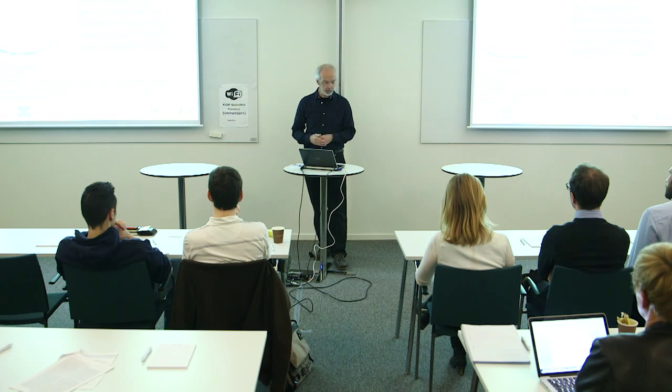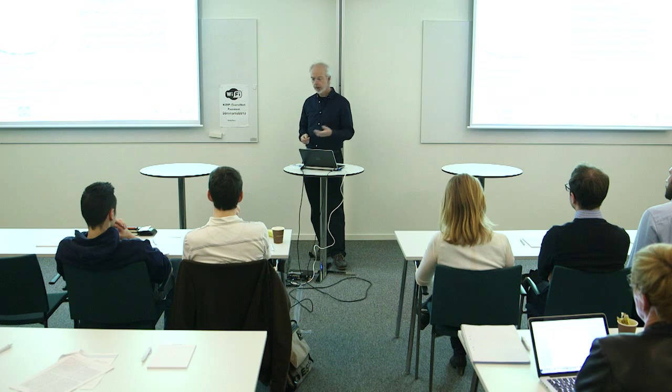That was done before we went into this technology, and it gives a perspective of what you can achieve, because with these technologies I'll show you, and as Ida said, 1 microliter, and with a few panels you can look at many hundreds of proteins and get very good data.